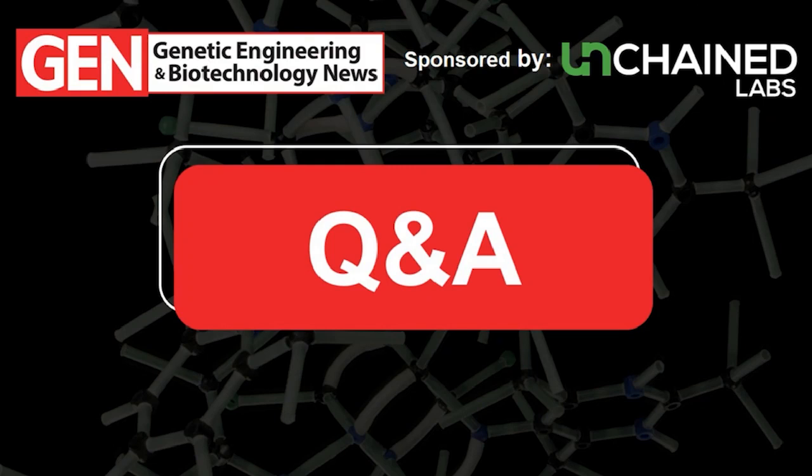So what Stunner does with partials is it will see them as contributing slightly more to full or slightly more to empty. So it doesn't have a third bucket that it says is partials. It just says one bucket for full capsid and one bucket for empty capsids. And then if you're looking at partials, then what you're probably going to want to see is a change in your expected results over time, but for, say, a standard that you do have completely full AAV with.